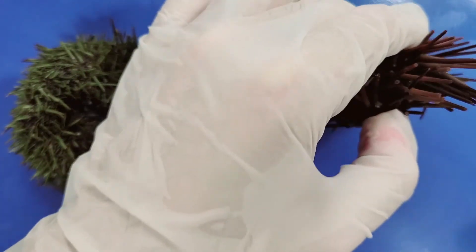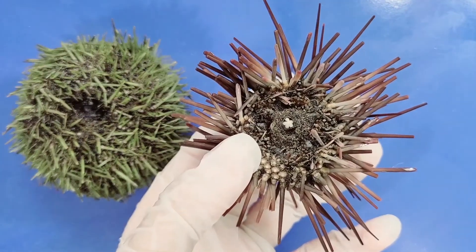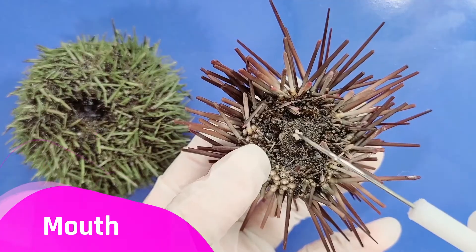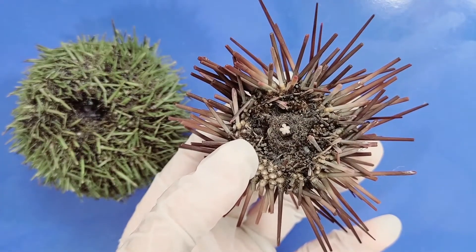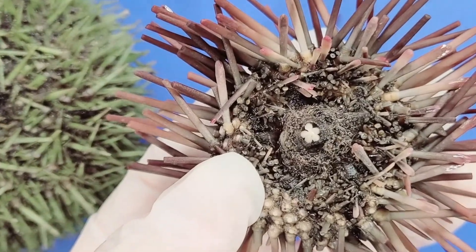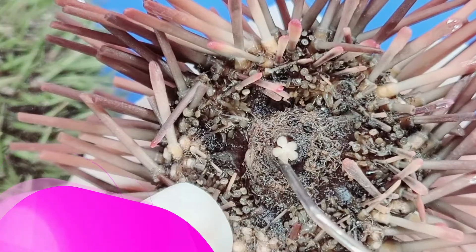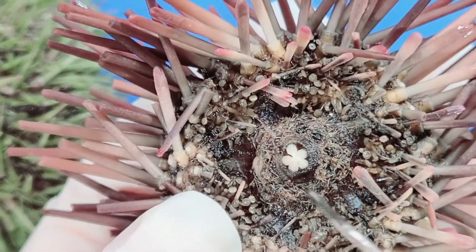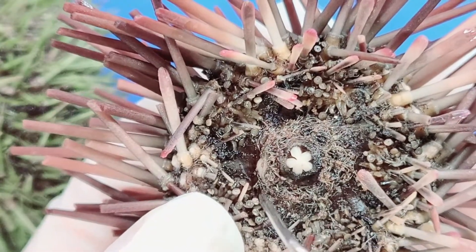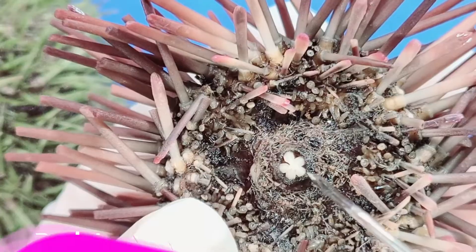As sea urchins move with their tube feet, they use their beak-like mouth to scrape algae off rocks. Zooming in, you can see that it has five teeth arranged in a circle. The circle around the mouth that is free of spines and is basically a hole in the test is called the peristome.